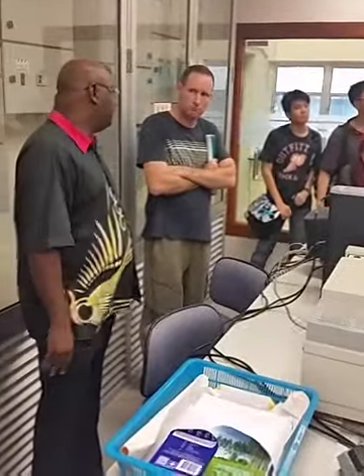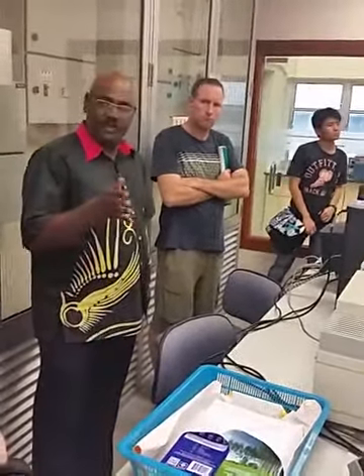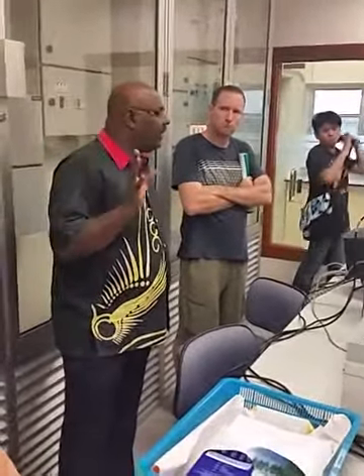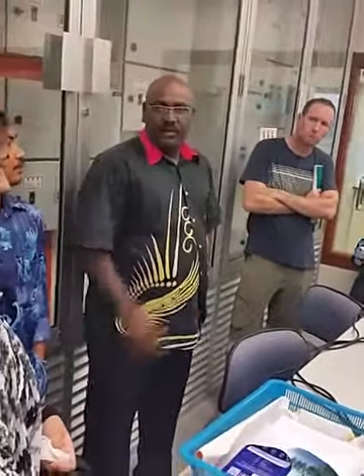It depends on the standard. You have to prepare all the standards, then do the calibration first, then you can run like that. But this machine is not very difficult to run compared to the XRF. The program is somewhat difficult.